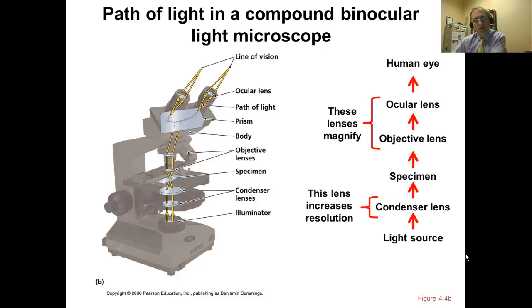In this video, we're going to talk about some of the principles in the practice of light microscopy as well as electron microscopy. Both these different types of microscopes in essence work pretty much the same, where an illumination source passes through a specimen. The light is then magnified until it finally hits something that detects the light that's passed through the different lens systems. In the case of the light microscope, that would be the human eye. In the case of an electron microscope, it's some kind of screen or television that is actually able to view the electrons.